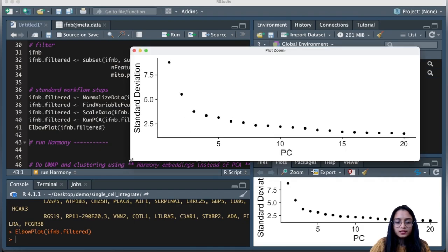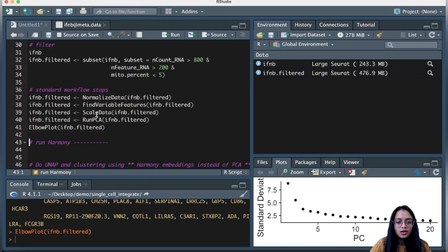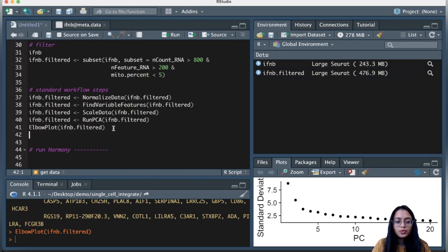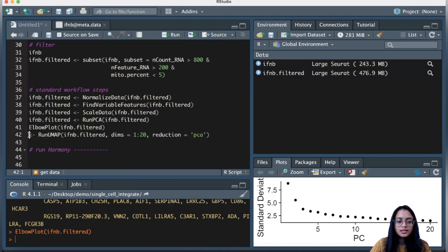Let's find the dimensionality of the data using an elbow plot. Looking at the plot, the first 15 principal components capture the majority of variation, but I'll err on the higher side and consider all 20. So I'm going to use the first 20 dimensions for the UMAP, running non-linear dimensionality reduction with the PCA reduction and saving it back to the filtered object.